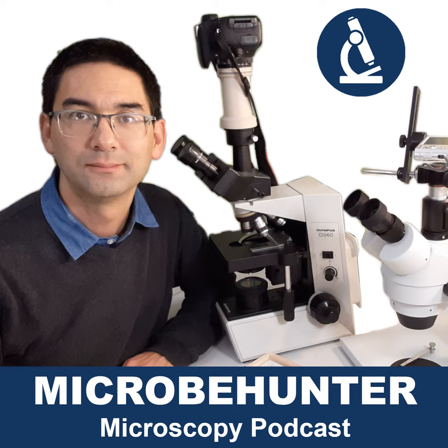In that sense, microscopy is relatively easy because you watch a couple of YouTube videos that explain how to use the microscope properly, and off you go. It's not really difficult. You can specialize yourself. There are some amateur microscopists who, when doing natural observation, are interested in specific organisms only, certain protozoa, certain algae, and they can become real experts in that field. That's going a little bit more into the research area.